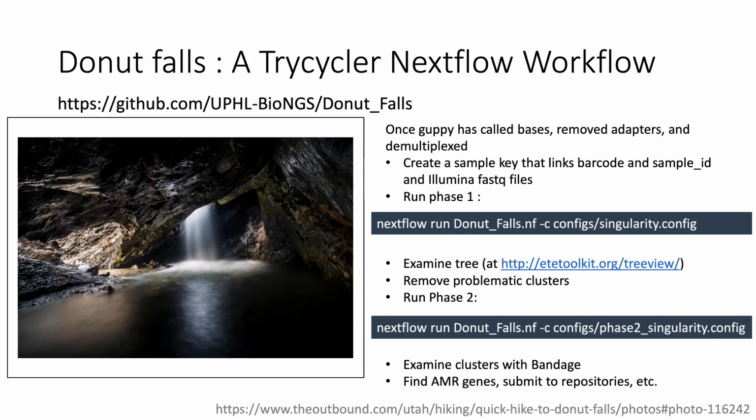And then at the end, you can look at your sequences with Bandage. You can take your assemblies to other tools like AMRFinder or other serotyping tools, and you can submit these sequences to repositories such as NCBI Genome, et cetera.